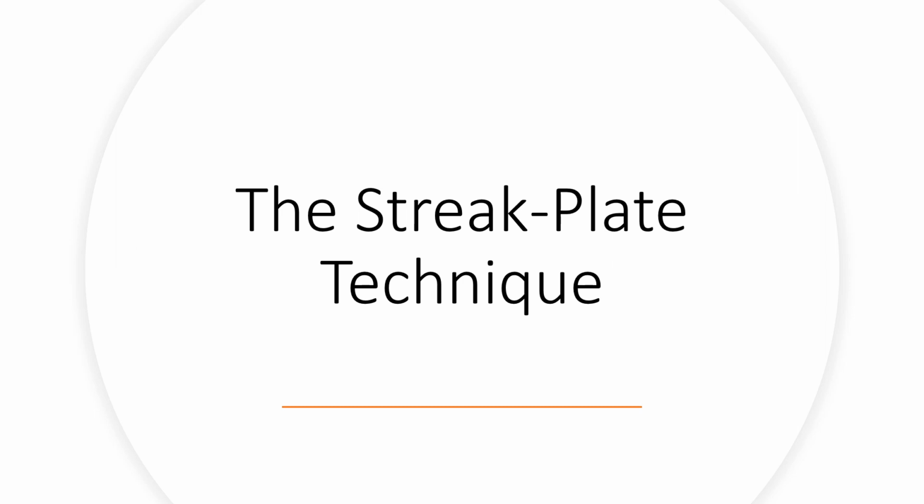In this video, I'm going to talk about how you could separate out that E. coli and possibly detect it.